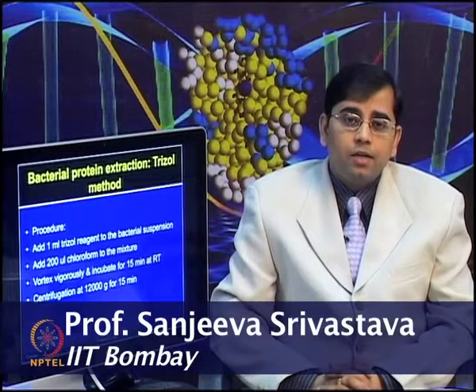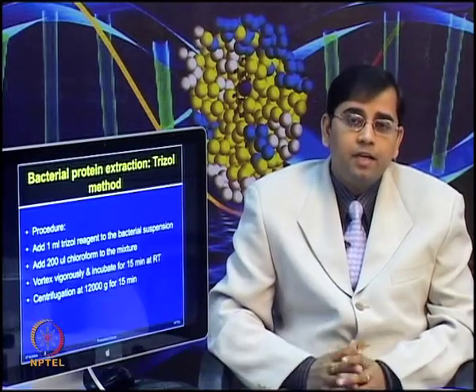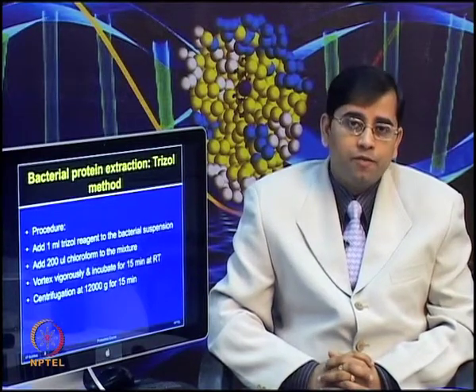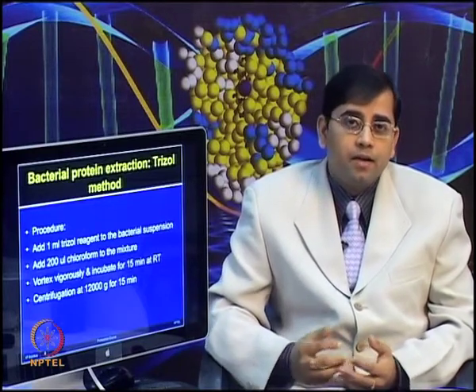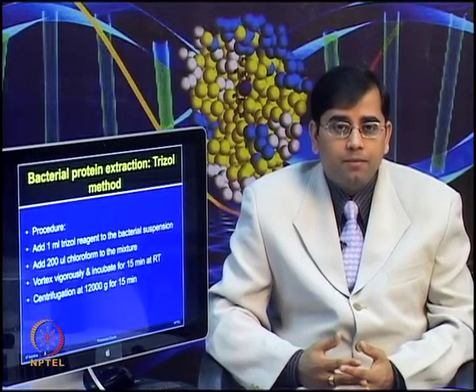Let me brief you about the procedure. This is not the exact detail of the protocol, I am just giving you a few numbers for your reference. One can modify these depending upon how much protein extract they want and based on their sample.